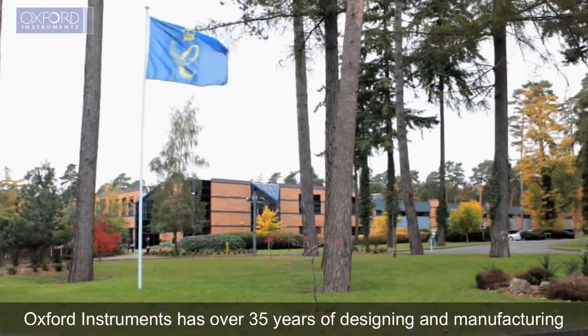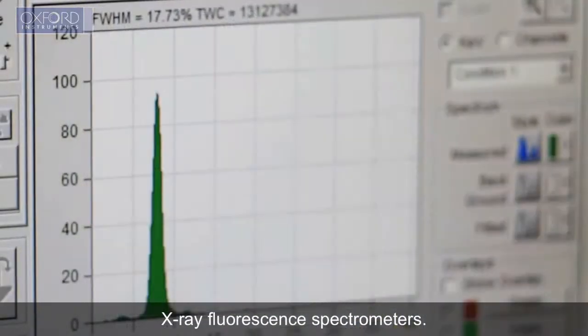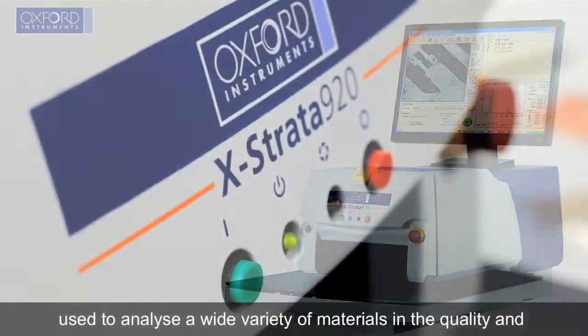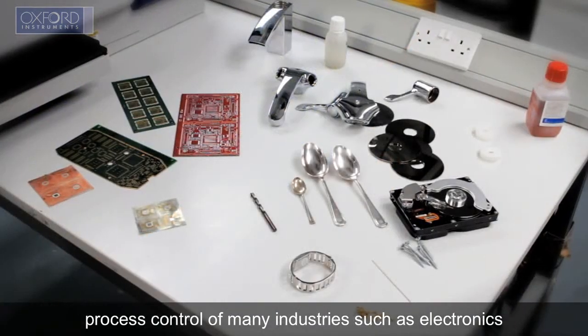Oxford Instruments has over 35 years of designing and manufacturing X-ray fluorescence spectrometers. The Xstrata 920 is a robust, easy-to-use, cost-effective tool, used to analyse a wide variety of materials in the quality and process control of many industries.